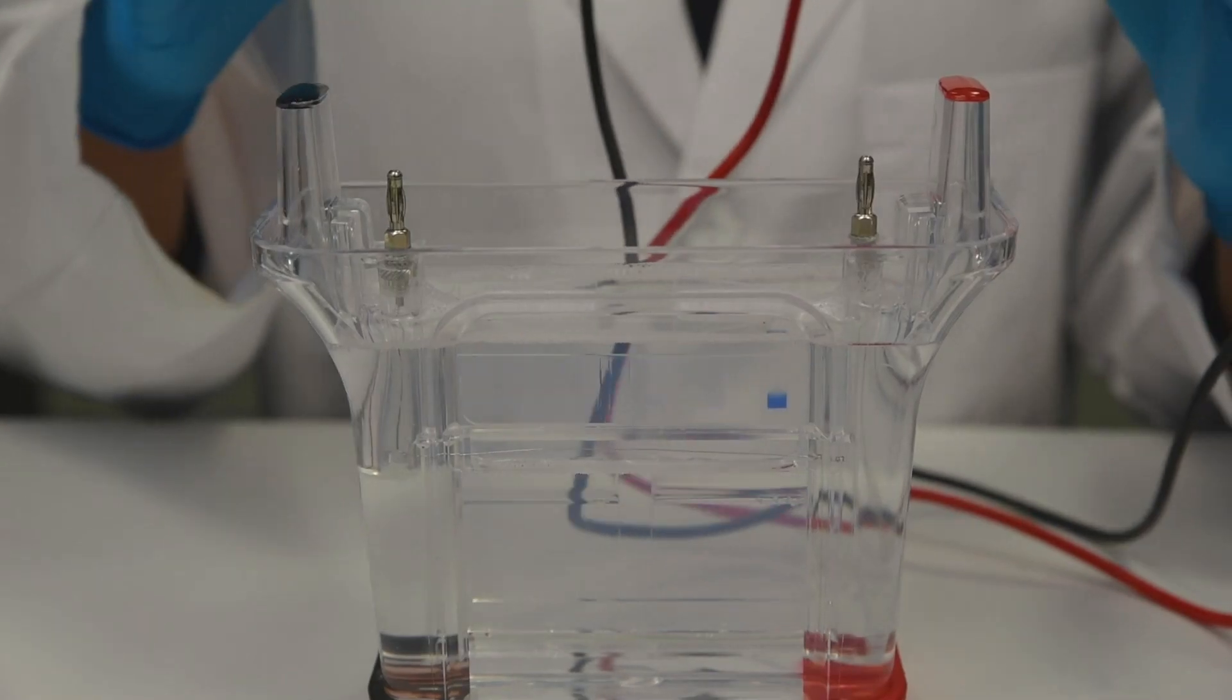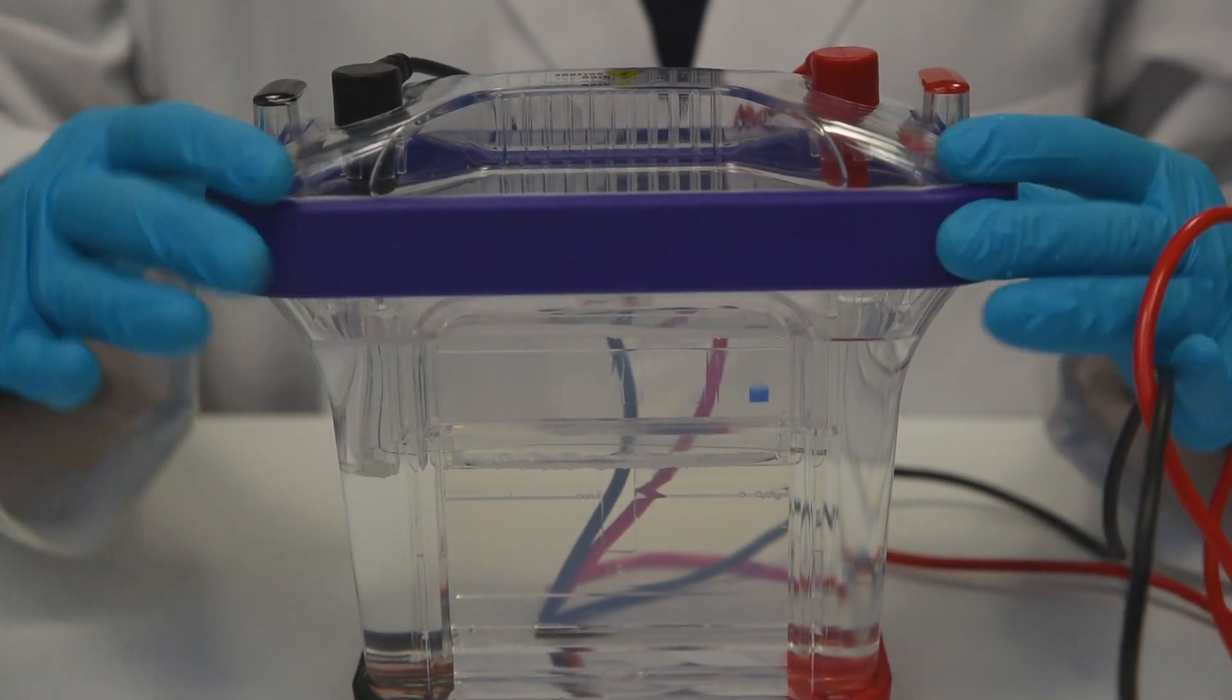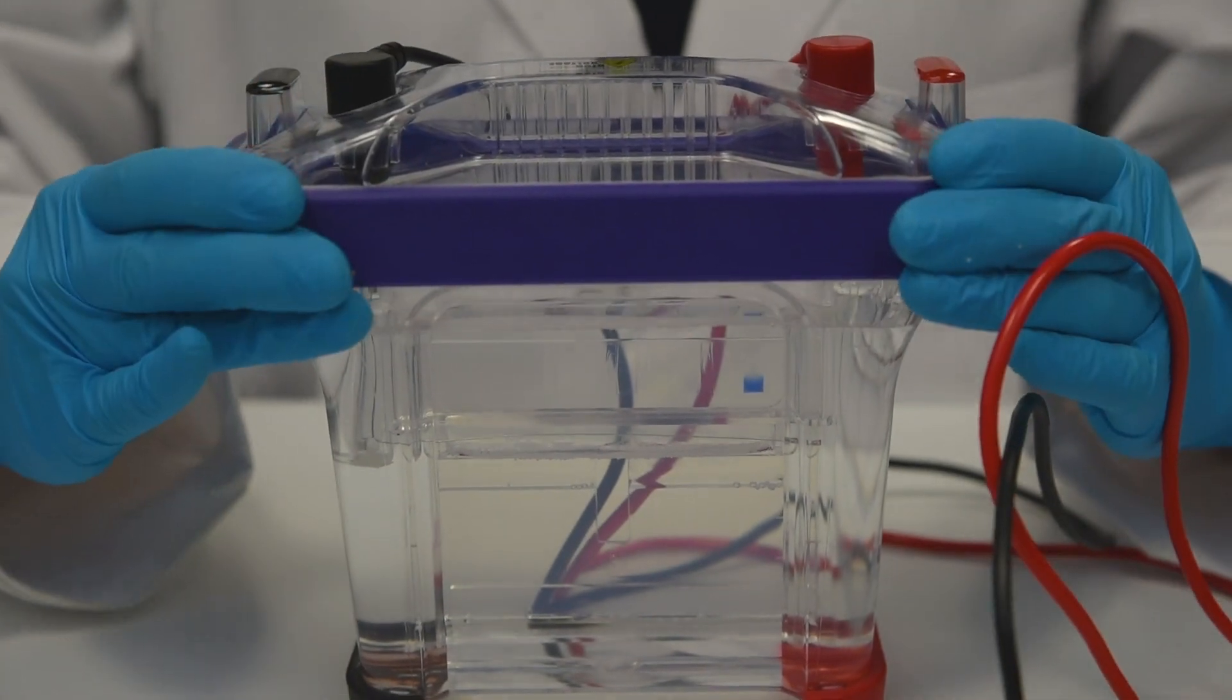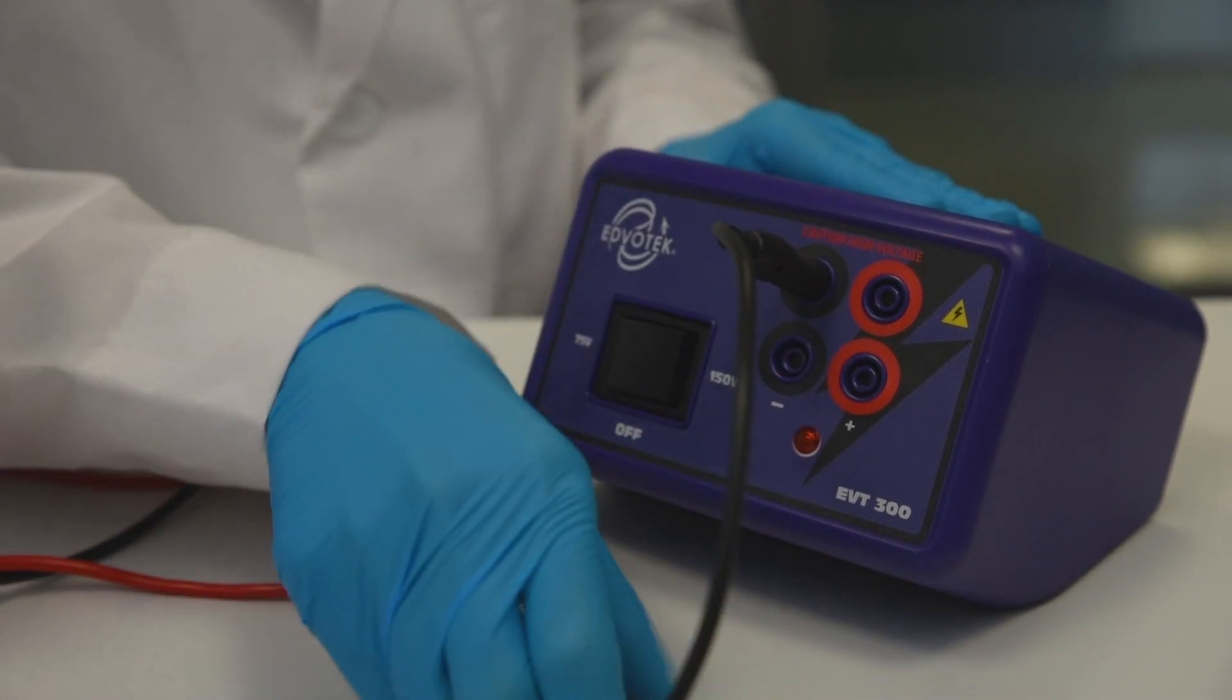Step 5: Once all samples have been loaded, carefully place the cover onto the electrode terminals. Step 6: Connect the electrical leads to the power supply.